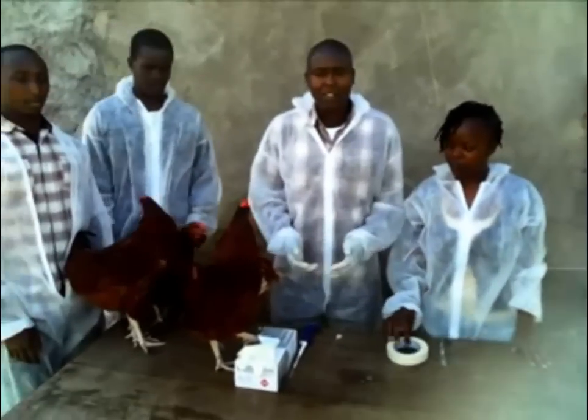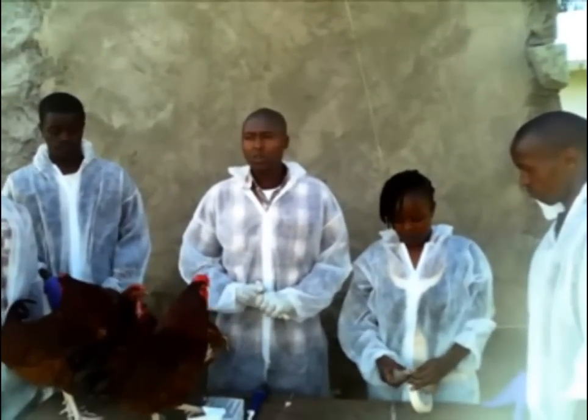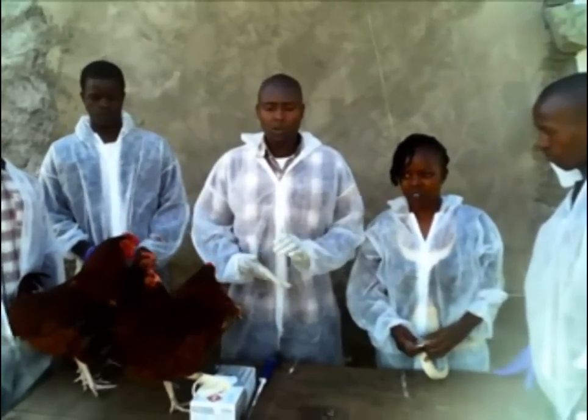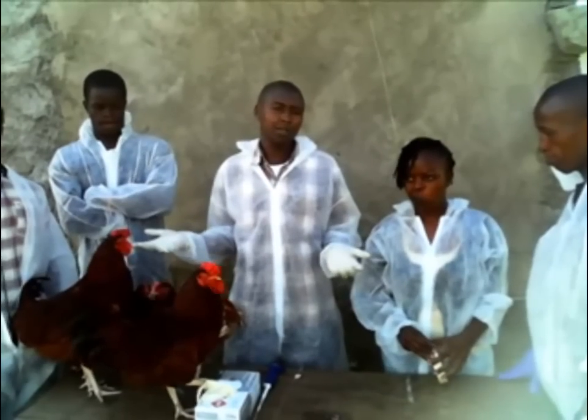Hey, welcome to the demonstration on how to assemble the cocks. To do this, we get back to the cocks and this will start to help you.